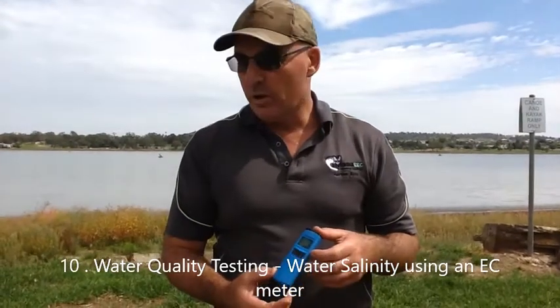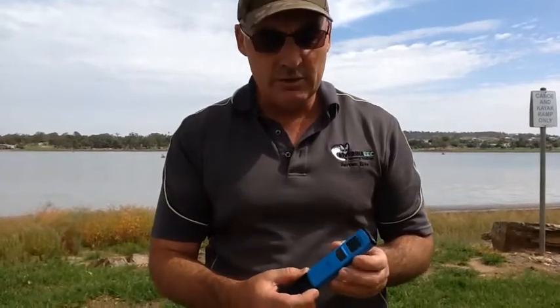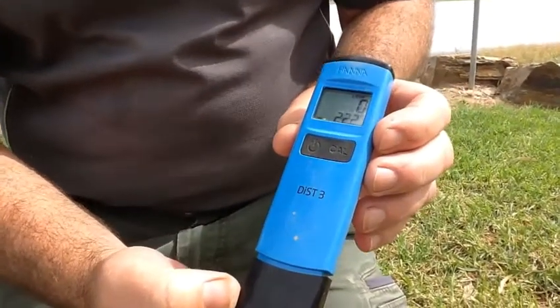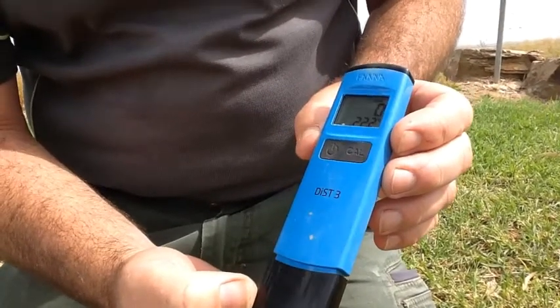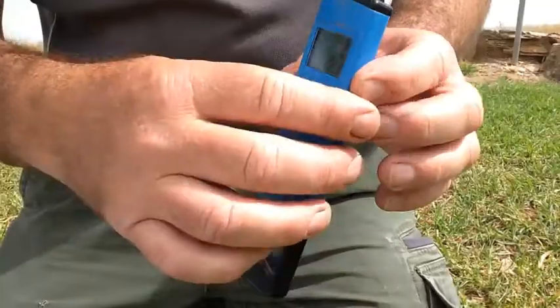The second water quality testing test that we'll do today is salinity. We're measuring electrical conductivity units. We're using an EC meter, a salinity meter, and this reads the temperature and also reads our salt concentration in microsiemens per centimetre.